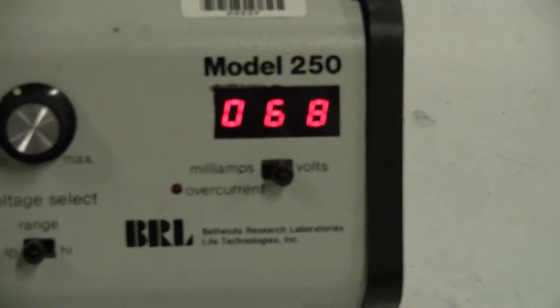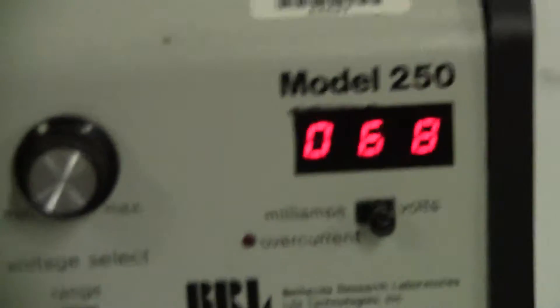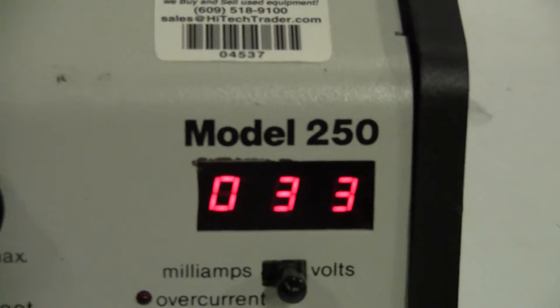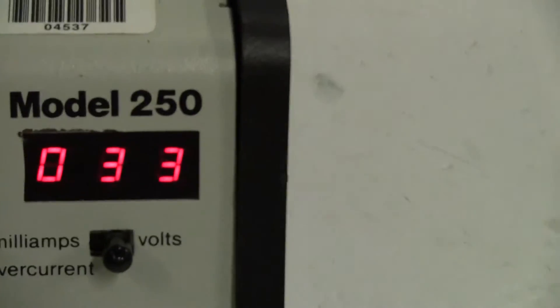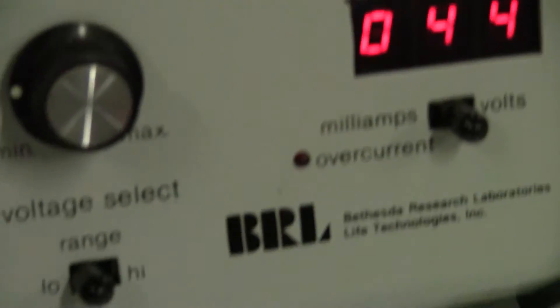It can work either in the milliamps or voltage range. You have adjustable voltage here. You have a high and low setting. And then your outputs.